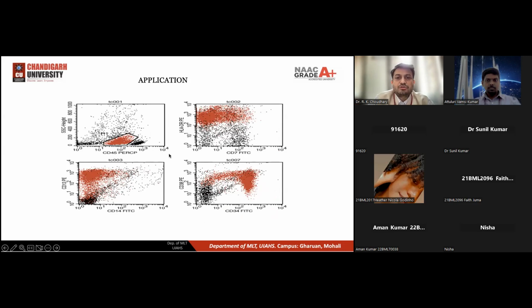Now we have to check it. As per your experience and expertise, because if you capture only one cell, then your result will be very varied. So here we need expertise, because with different colors you can select an area where this type of mixed color is coming. You have to identify which cells to take, and this comes with your experience.